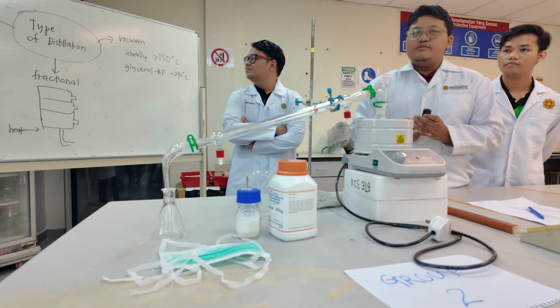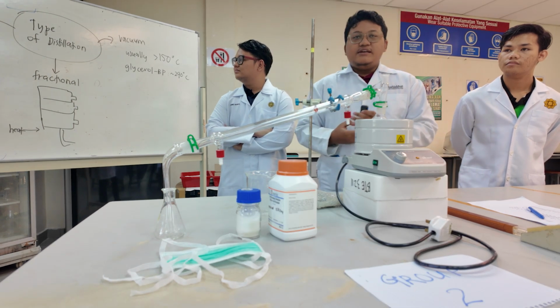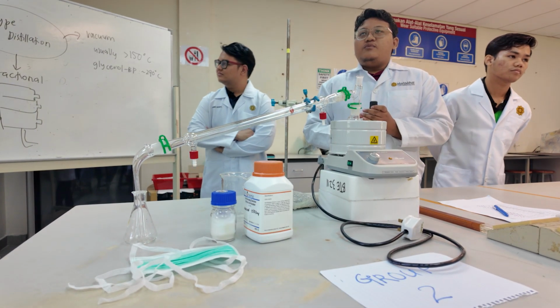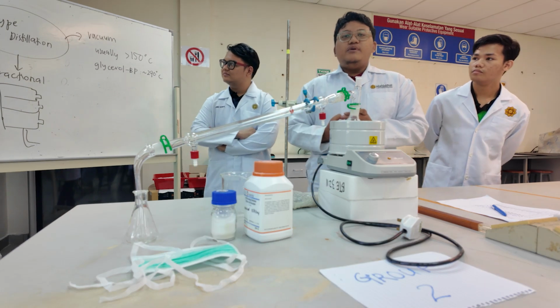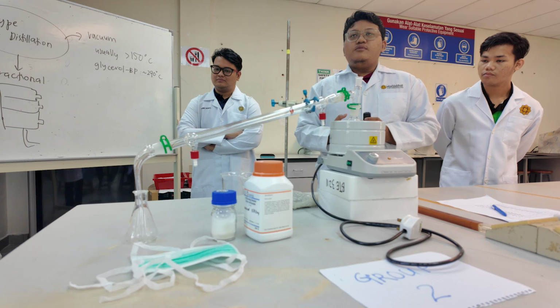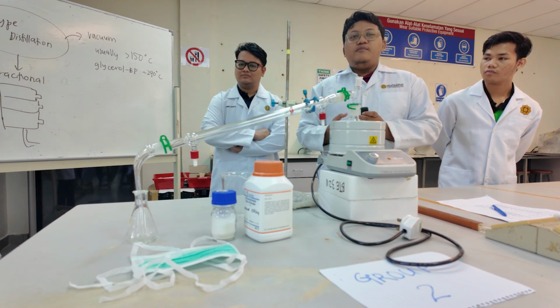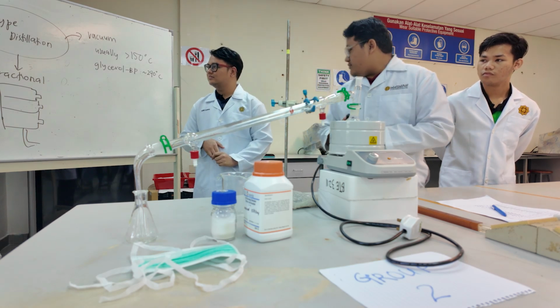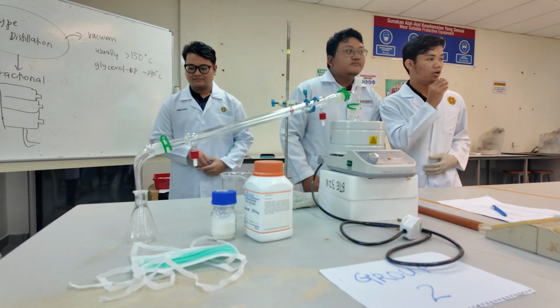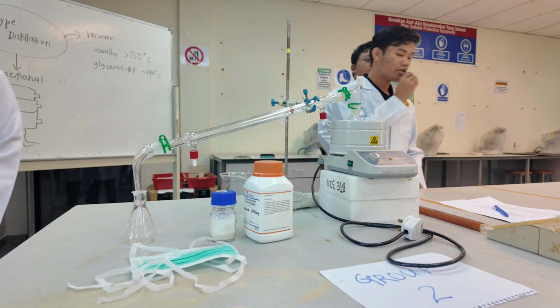Second, we can use it to purify solvent in a mixture, and lastly, we can isolate valuable components in a mixture. For example, we want to extract alcohol from a fermented liquid. Okay, so that's all for the introduction part.